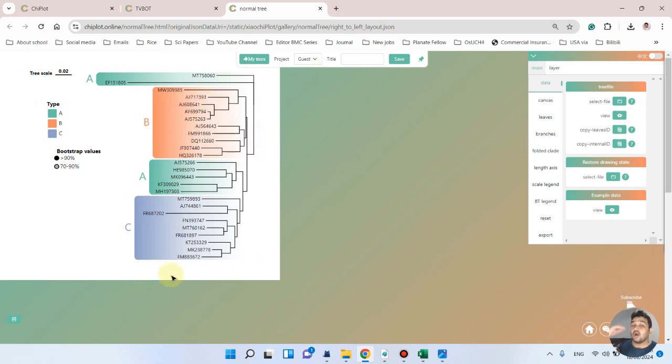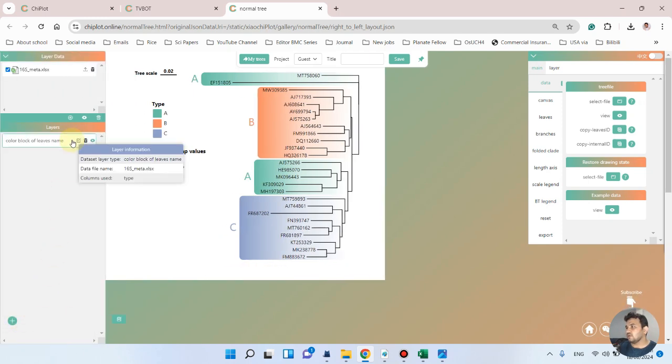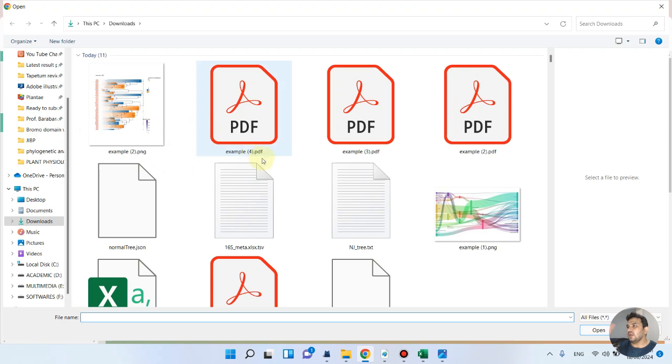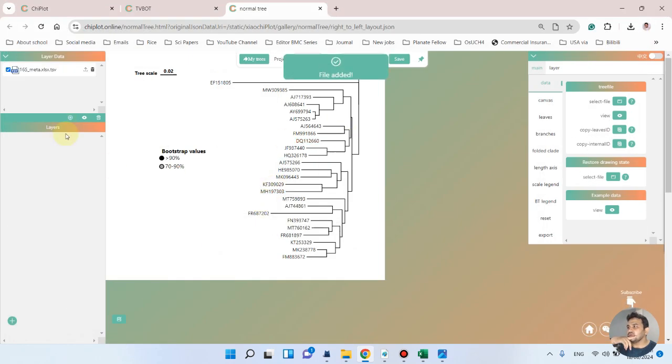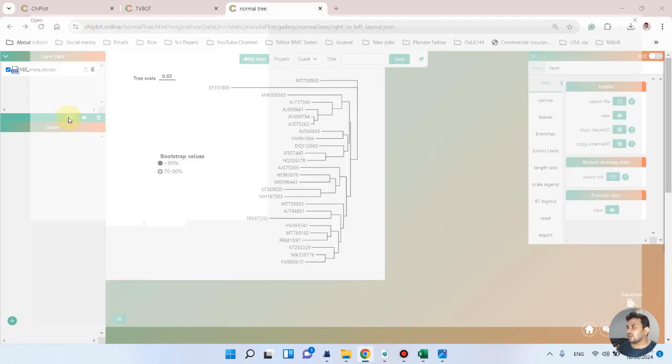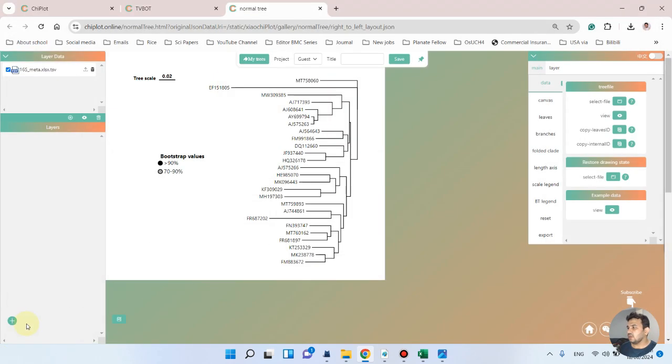And as you know, now we will add its metadata. So you see here now we will go to its metadata, which is already added, so maybe we can delete it first and go back again and add this metadata. So you see here now metadata is actually added. So now we want to color this, so similarly like previously, we can go with this plus sign.